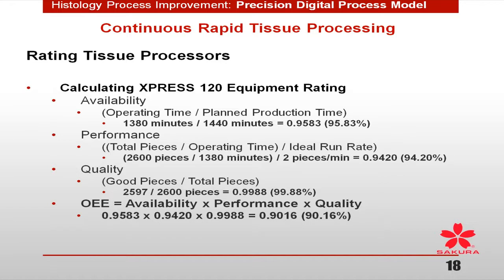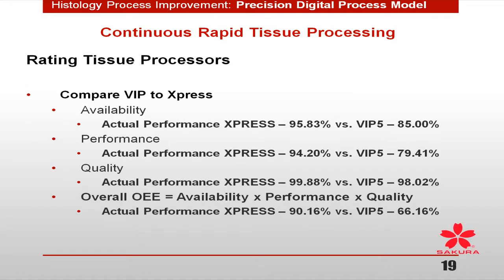What does that number tell you? Is it the best instrument? Is it the only instrument? What does that number tell you? Well, when you use this lean process tool, it's telling you that if you score 85% or better, that instrument is going to help you in your lean processes and not be a hindrance. Does it tell you whether or not the sample is a superior sample or not? No. It just tells you that that instrument can work well within your lean process.